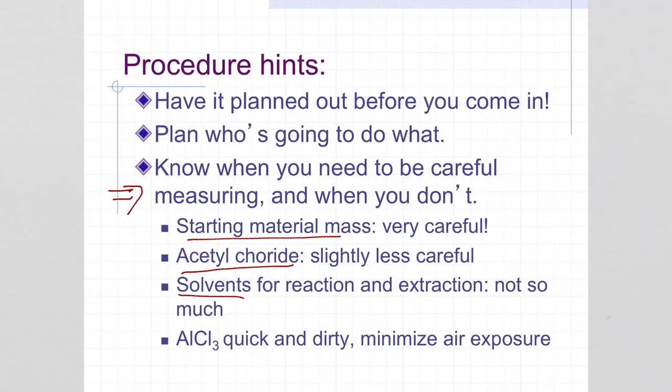The aluminum chloride, because number one, it's present in a large excess, and number two, it's so reactive with water that it will react with moisture in the atmosphere. You really want to measure that out very, very quickly and minimize exposure to air.